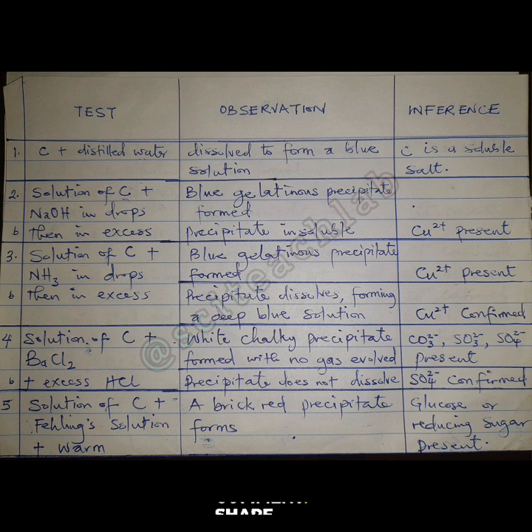All right, so we have reported that second practical. We have found out that the copper salt is copper sulfate. That means we know now that there is copper sulfate in that mixture. But the question says it's a mixture of 2 salts. So it's now time to find out what the other salt is. We found out that this is copper sulfate as one of them, because we find Cu2+ ions and SO4 2- ions. If they come together, they form CuSO4.